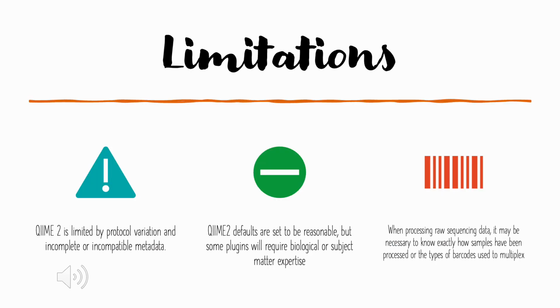What are some limitations to this program? Because we're inputting large amounts of data, they might not all be coming from the same protocol. So that variation could change the data that you have collected. Part of your data could be incomplete, part of it could be incompatible because of this protocol variation. So you may not be having all of the same standard data, and that could cause some errors in the analysis that you do complete.